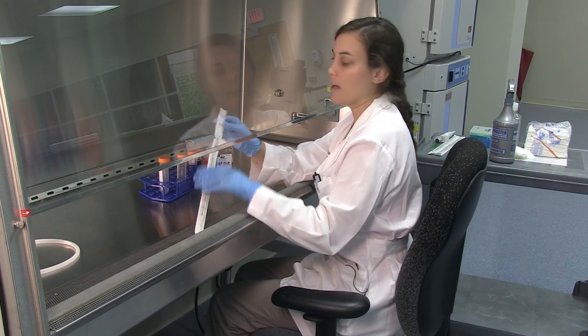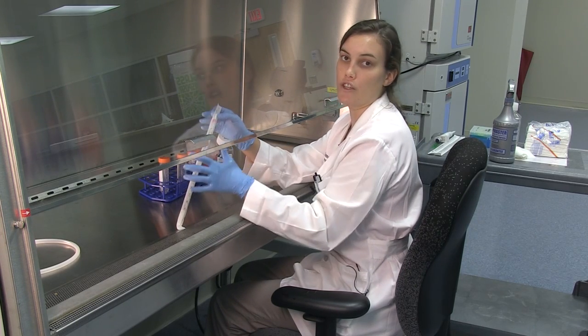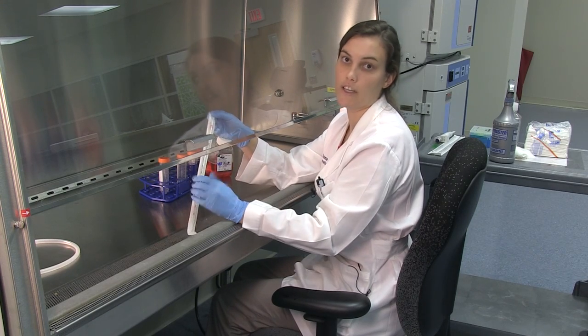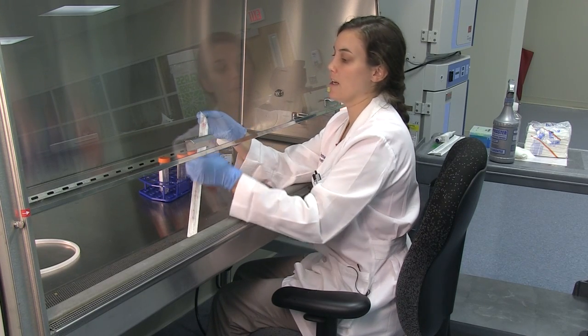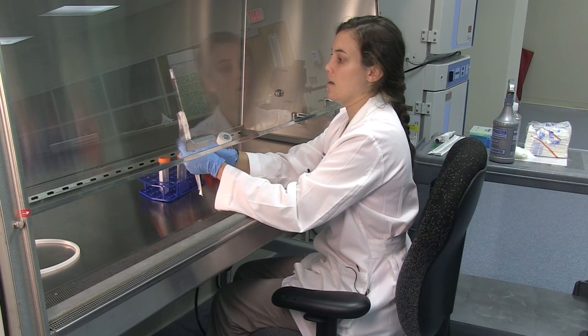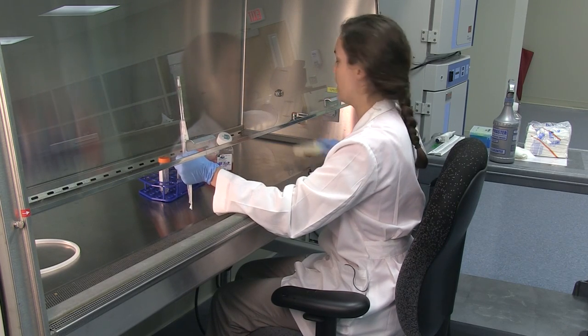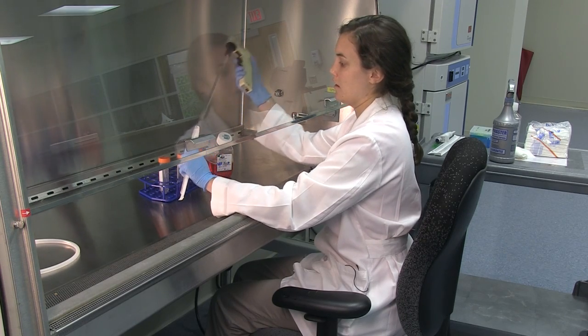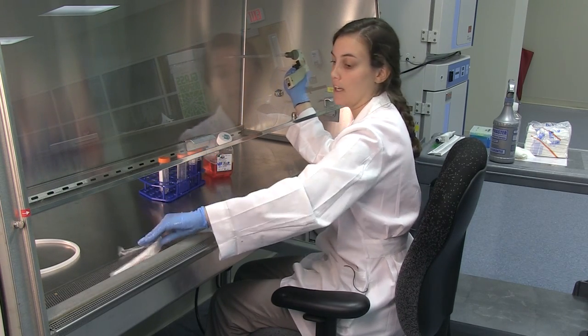Second, when opening the pipette, you want to make sure that you're not touching anything with your hands. Everything inside of the package is clean and you want to maintain that, so open it carefully so that you're not touching anything. Then you can take your pipetter and discard the wrapper for later.